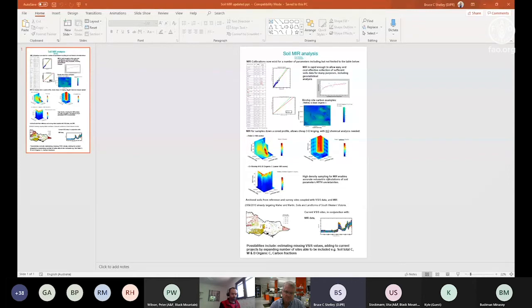Soil ameliorants is another area of interest, particularly as we're looking to use more organic materials to address subsoil constraints. Understanding carbon pools and flow, because we can fractionalise the carbon, and the integration of data from multiple sensors. So some of these issues that are going to affect the whole industry is this question of comparability: global versus local versus bespoke.